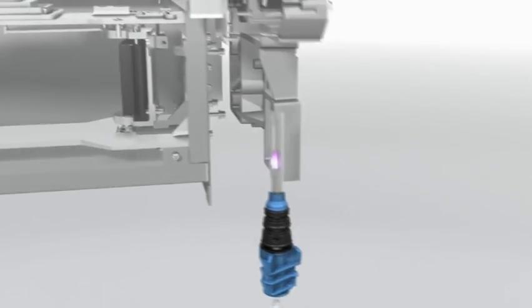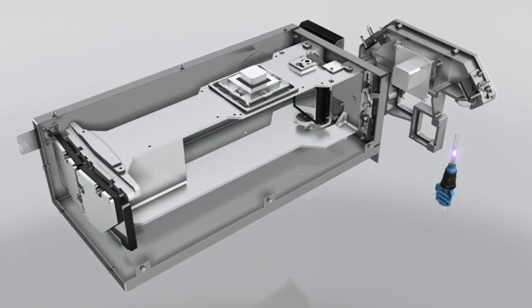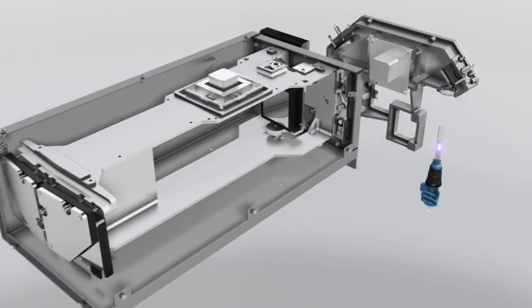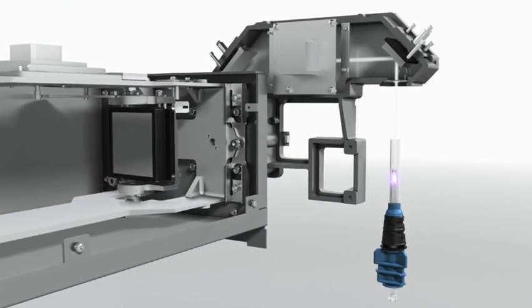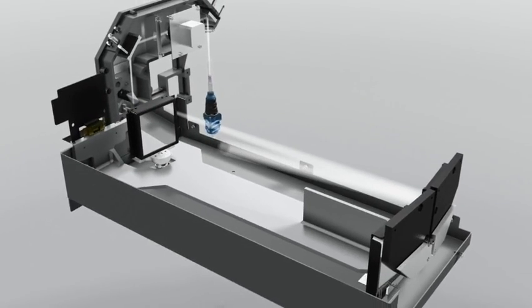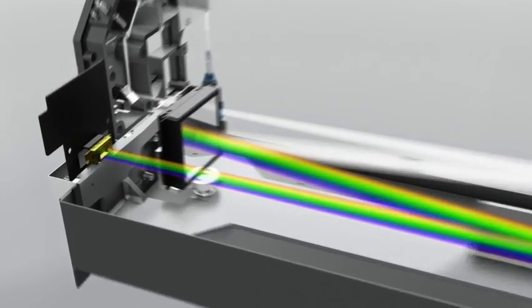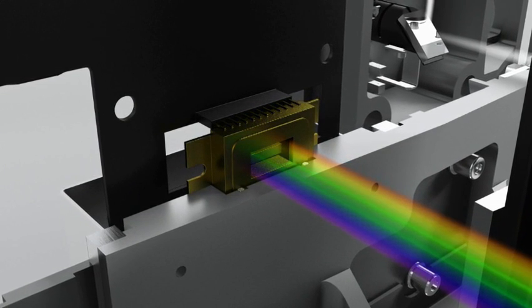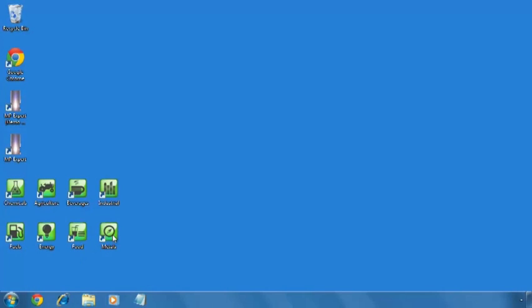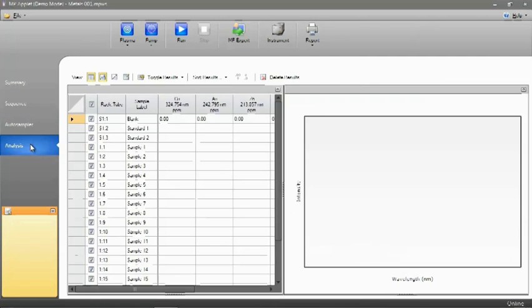The optical system provides axial or end-on viewing of the plasma for best sensitivity. The vertical torch ensures extended operation with challenging samples. Emission from the plasma is directed to the high-resolution, fast-scanning monochromator. The selected wavelength range is imaged onto the high-efficiency CCD detector, which measures spectra and backgrounds simultaneously for optimum precision.